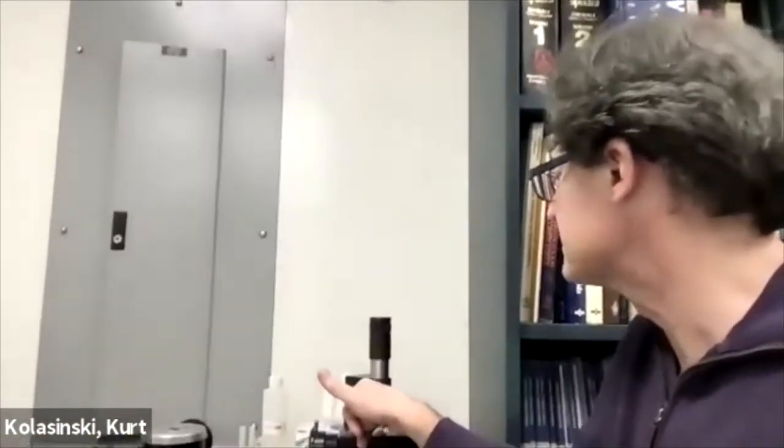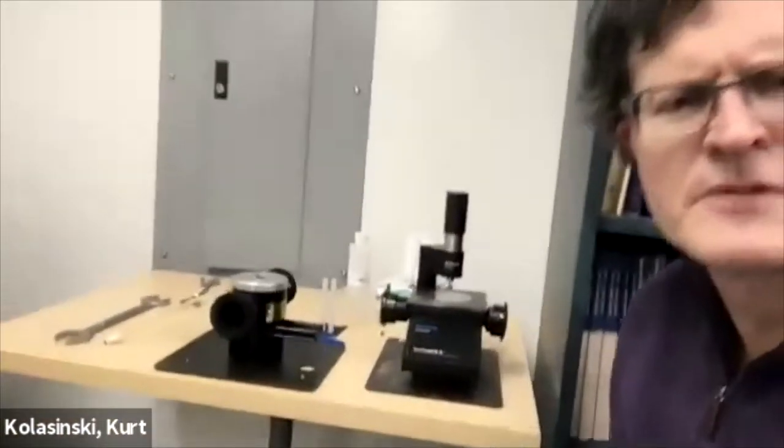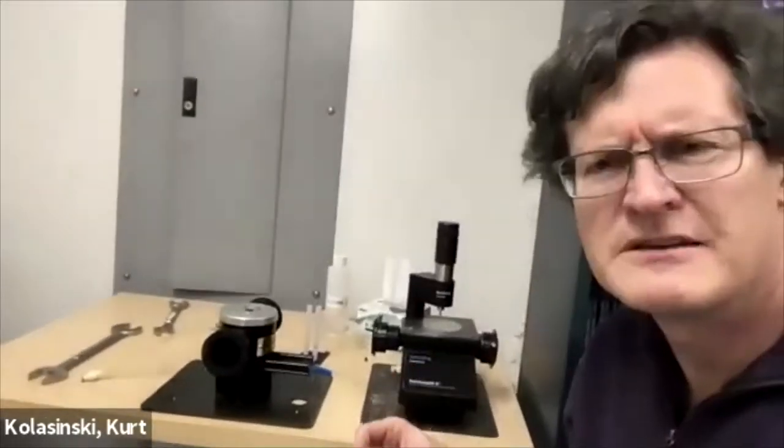The prism is exposed to a little hole up at the top. I don't know if you can see the hole just there. That would go underneath this little anvil. And you can do either liquid or solid samples with this one, right? You can take the IR spectrum of those. There's an evanescent wave that comes out of the prism, and that probes the material above it. They'll use that in forensics. And then I think they might use it in the inorganic lab too.